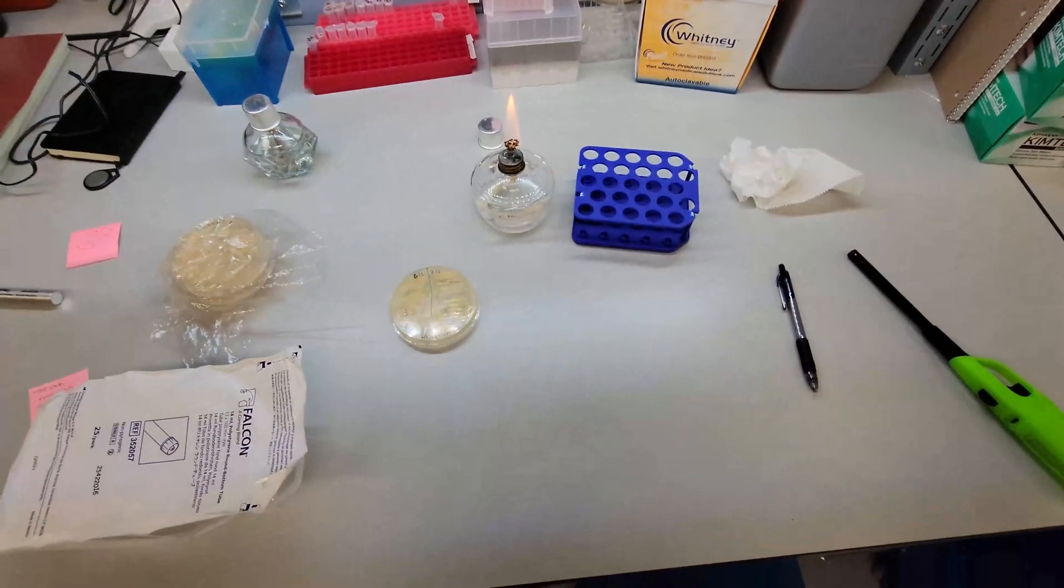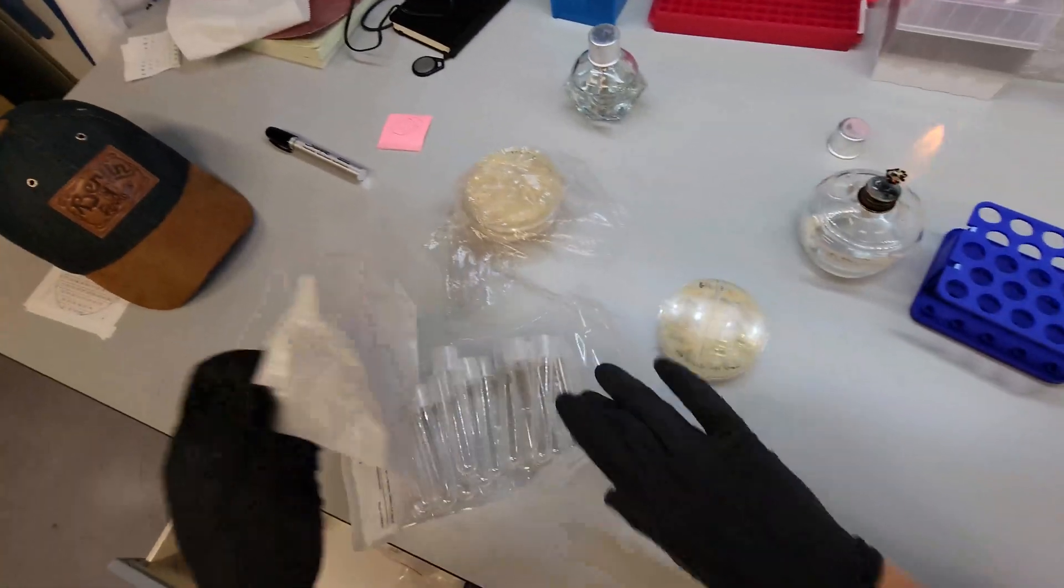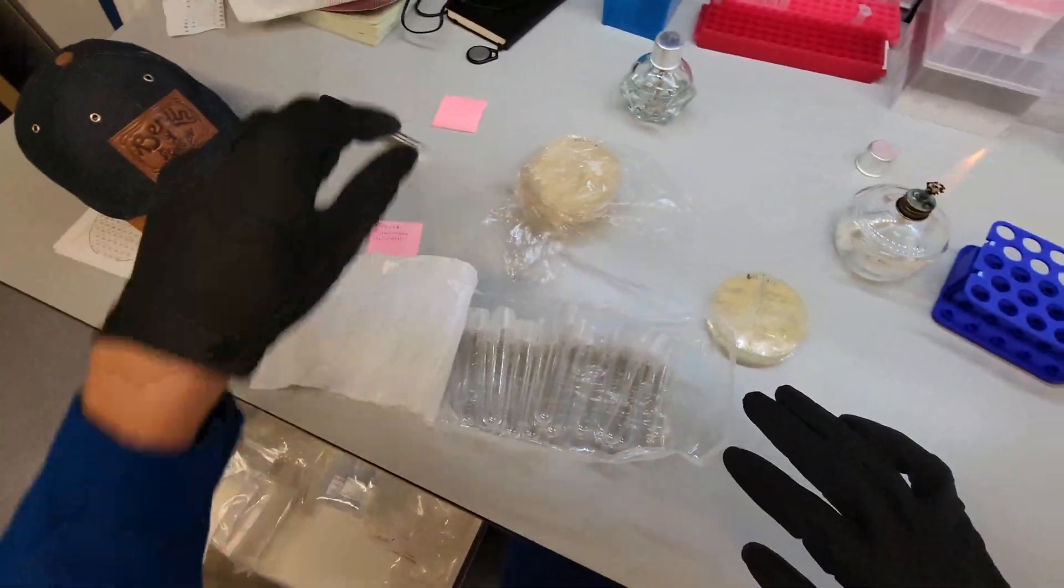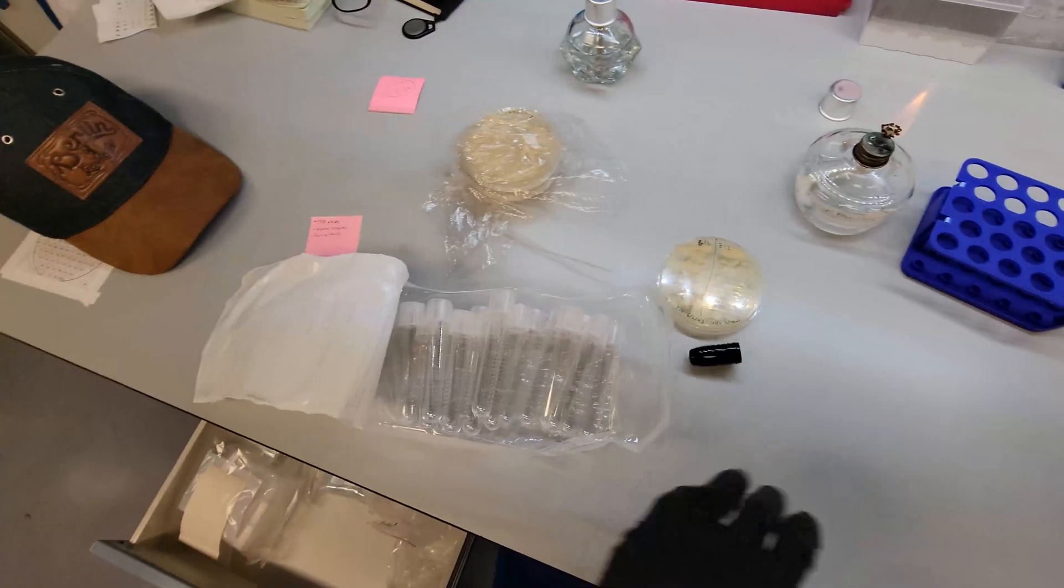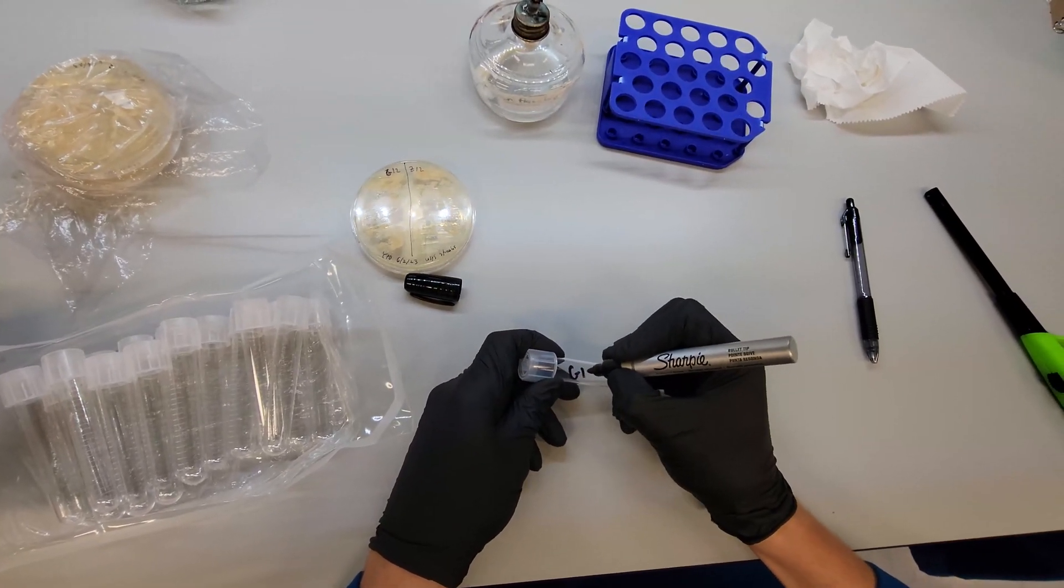The flame creates an updraft to keep any contaminants from falling down. At least that's what they tell you. I think it's just like a wizard's spell or something. You hop up and down on one leg a few times and you don't get any contamination.